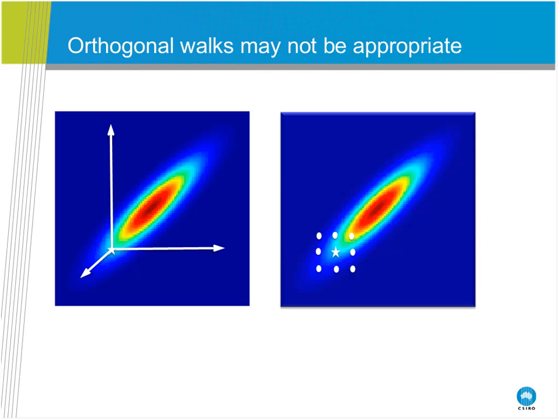And so here I'm trying to actually display why your grid screens may not be appropriate. So say you get a hit at this position here, and you do a grid screen, and you test 3 factors, and you can actually quite nicely miss your optimal, which is here. If you're doing more of a random walk around there, there's much more chance that you will actually start heading in the right direction because you can see where to go.